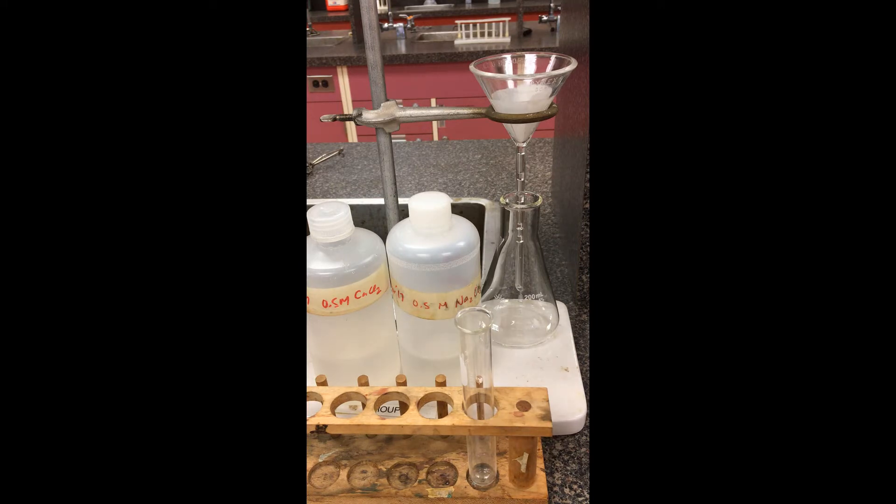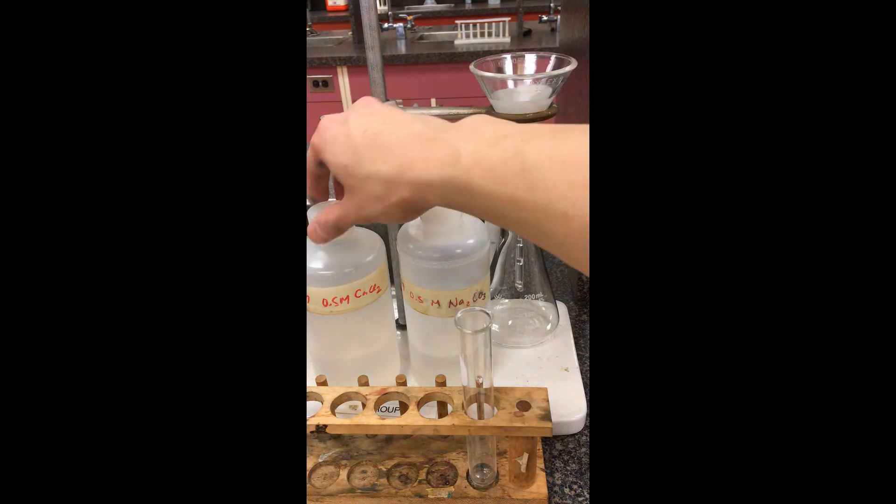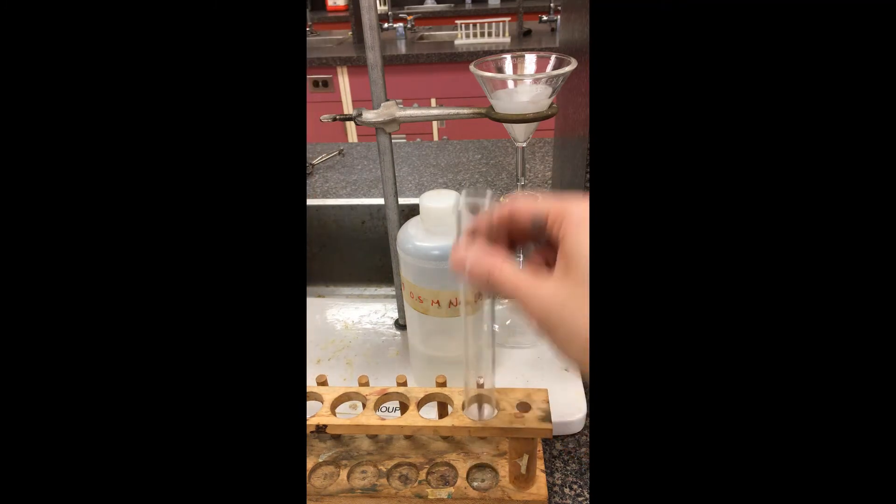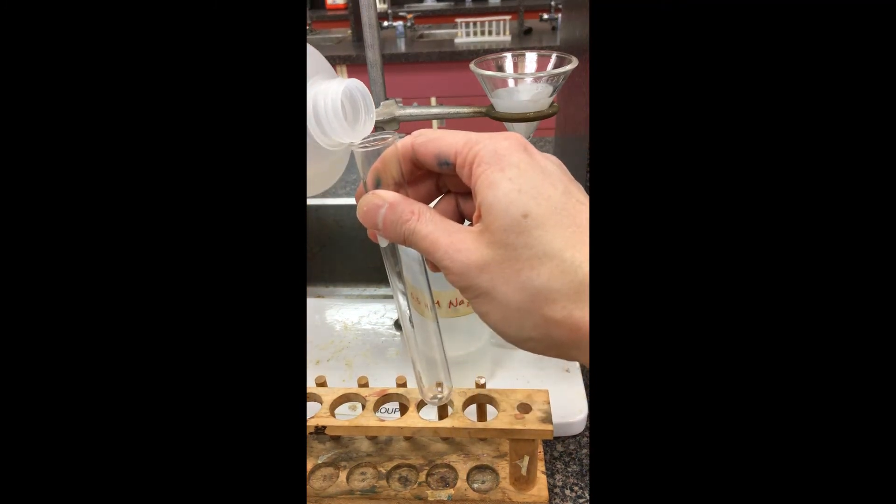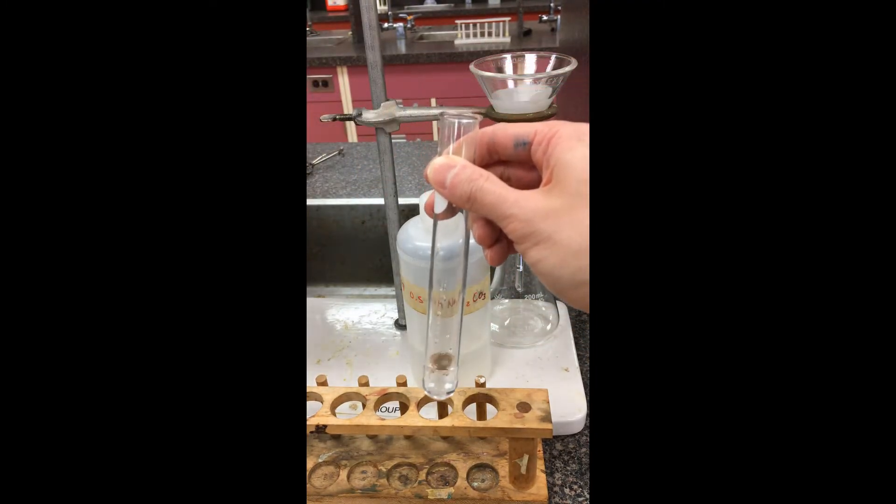So I'm just going to do a simple demonstration here between calcium chloride and sodium carbonate. It's going to be a double displacement reaction here. We're just going to pour this into this test tube. This is a double displacement that forms a precipitate, so that's the calcium chloride solution.